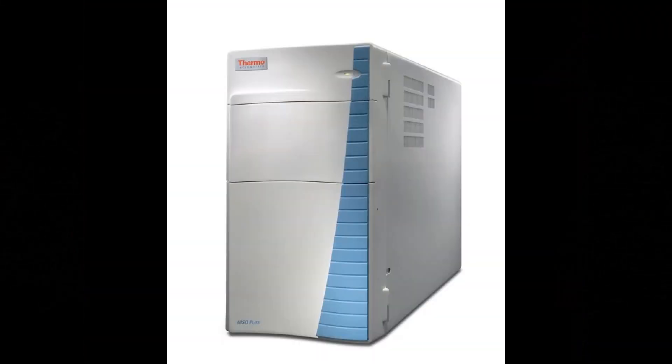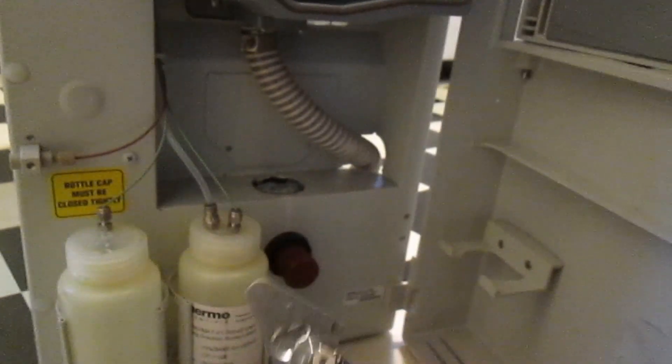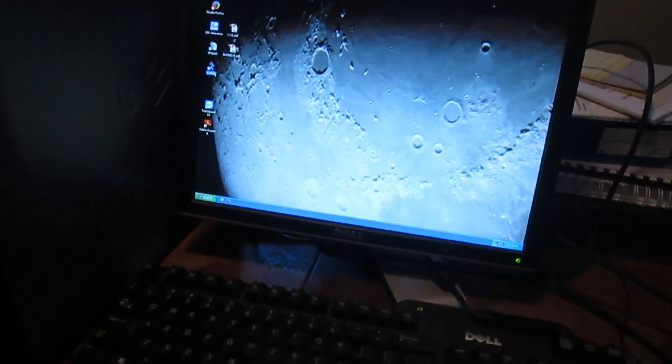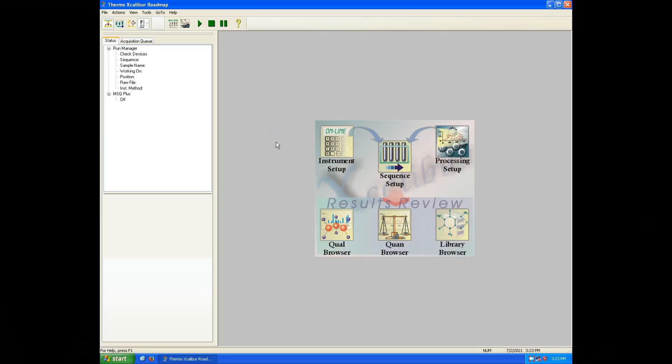The Surveyor MSQ Plus, made by ThermoScientific, is a single quadrupole mass spectrometer that operates on two injection modes: electrospray and atmospheric pressure chemical ionization. This unit seems to be in fair condition and only required a few minor repairs, and it also came with the computer and the operating software Excalibur.